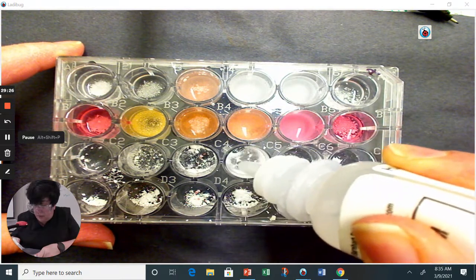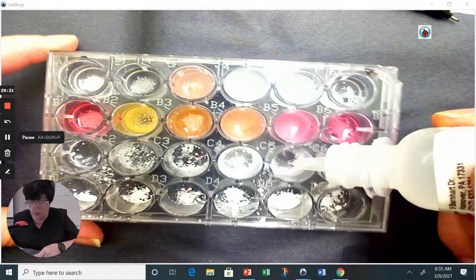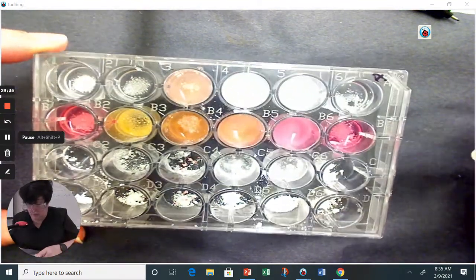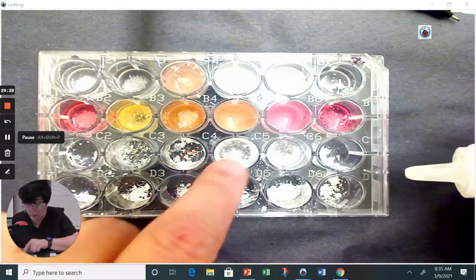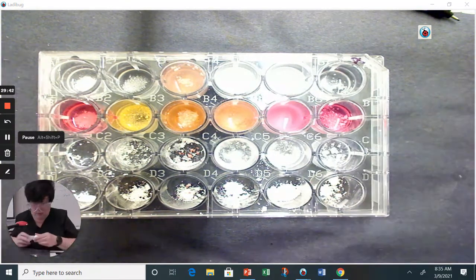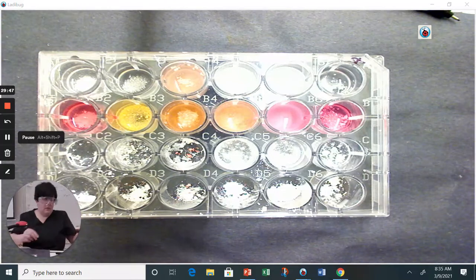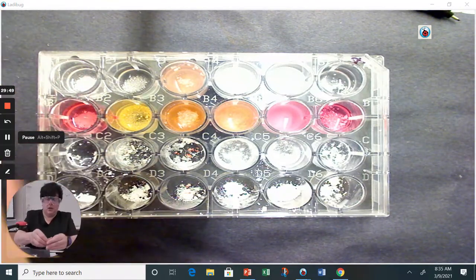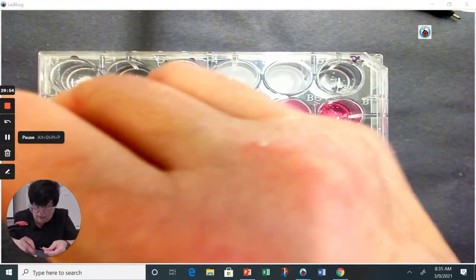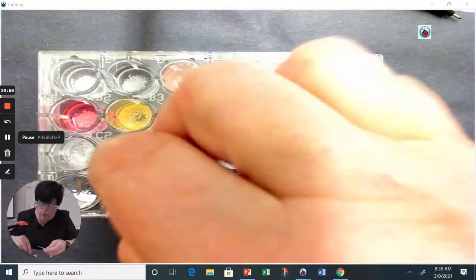So I'm just covering the bottom of the well. Oop, that's bubbling. Whatever number 1, 2, 3, 4 is, it's bubbling. I don't know if you can see, it's all bubbling around the edges. Okay, the last 2 aren't doing anything. I'm just going to see, does it dissolve anymore? So I'll take some toothpicks and just swirl around in there to see if the acid has it dissolve any better. Again, I'm flipping it over.